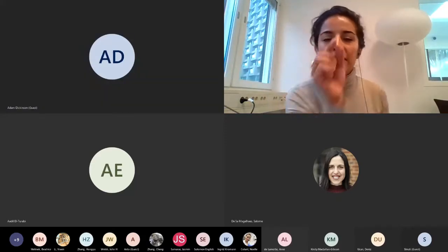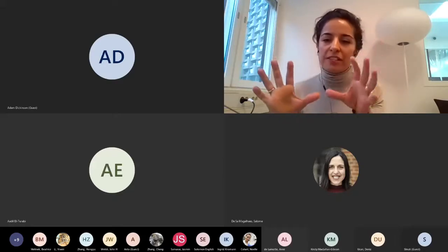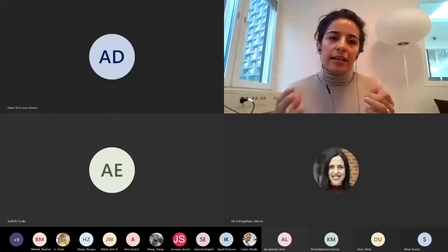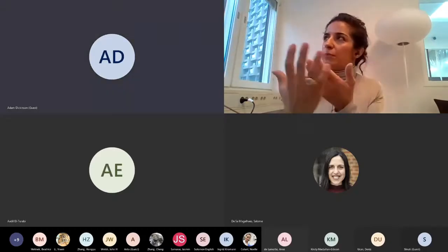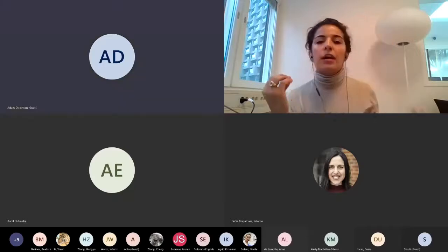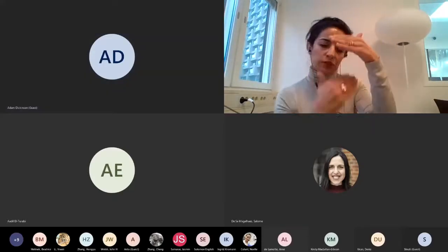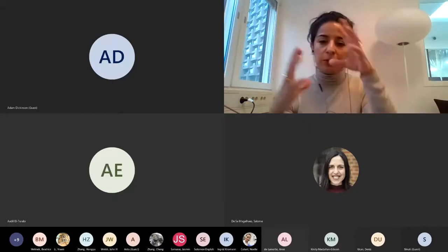Adam, one of the things that I think maybe you saw is that some of the detections of those VLPs were done in dark areas. This is one of the benefits of using a CNN: when we are training it, we can give it not just perfectly contrasted particles. Some of the ones that were detected were in darker areas, and it could pick those out. With a standard workflow of standard image analysis, it would lose those particles where the background is very dark, or where they are part of something else.